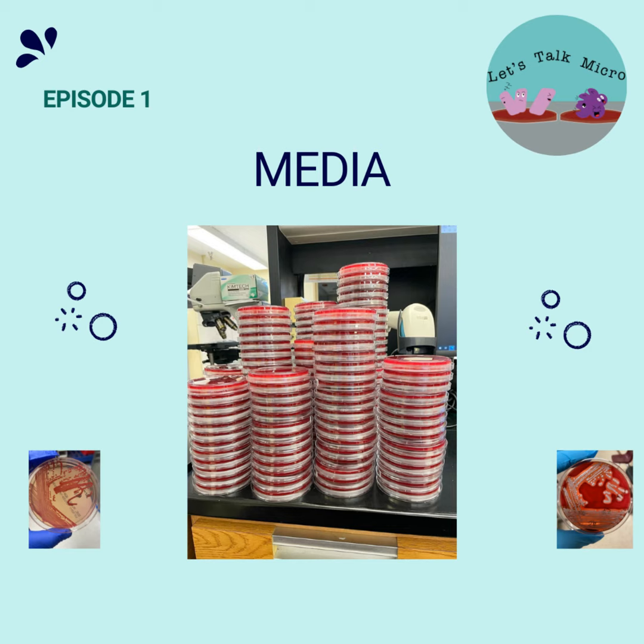So the nutrients are in this agar that they need to grow, but what else do they need? Do they need anything else? Yes, right? They need oxygen and carbon dioxide. As you know, most organisms, they're either aerobic, anaerobic, or facultative anaerobes, right? And actually, most of your classic pathogens are facultative anaerobes, which means that they grow aerobically, but they can also grow anaerobically. So that's why you have these incubators that have carbon dioxide to give that to the organisms so they can grow. And they also need the right temperature, right?